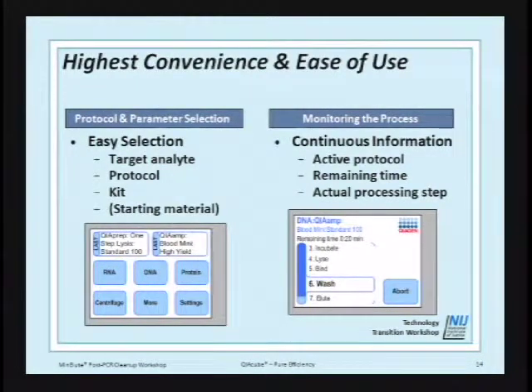As you saw yesterday, you press go, and 30 minutes later, we were able to pull out our cleanup samples. Once everything's in place and you have it initially set up and you get used to running it, as we saw with the second group, all the buffers were in place, so it was really maybe 5 or 10 minutes setting it up, and then we pulled our samples out. So it has the touch screen.